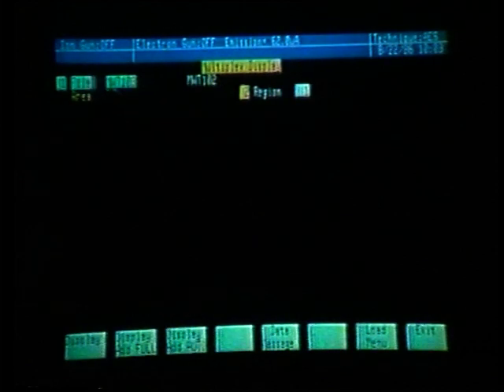MWT103 is now highlighted. That is the file we wish to manipulate, so we will leave that highlighted. For the multiplex data file MWT103, we looked at only one area, that being area number 2. This area line is telling us that we have only one choice in this particular data, and that is the one area which we acquired.